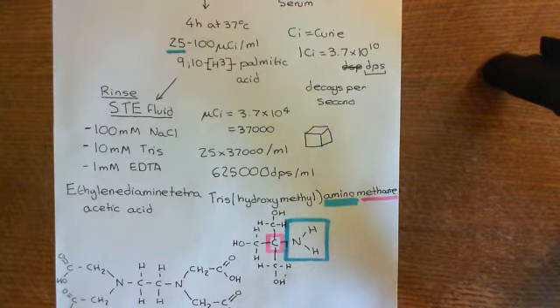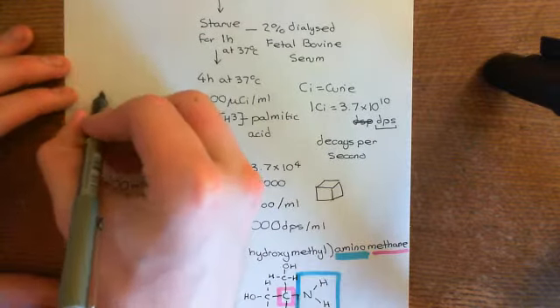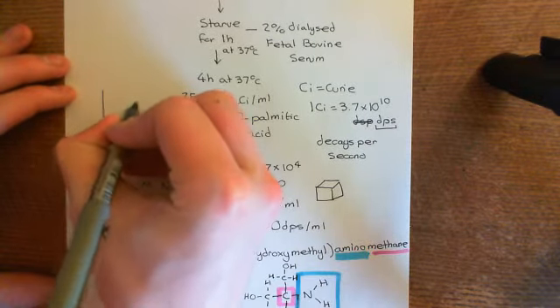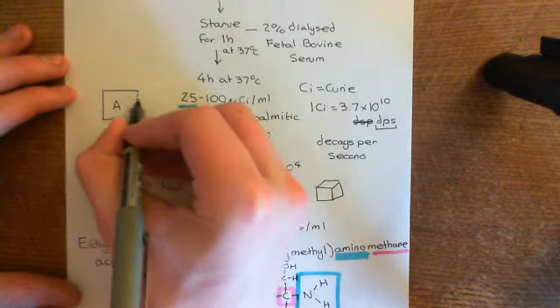So we're assuming, remember, that protein A is a protein which gets palmitoylated. So we've got all these protein A molecules that are waiting to be palmitoylated. You've just given us these palmitic acid molecules. We don't care that they're tritiated, so we're now going to stick them onto protein A molecules. So what's going to happen is that protein A, if it is a protein which has palmitoylation sites, is going to get these tritiated palmitic acid molecules stuck onto it.